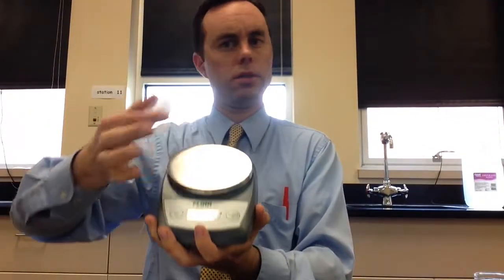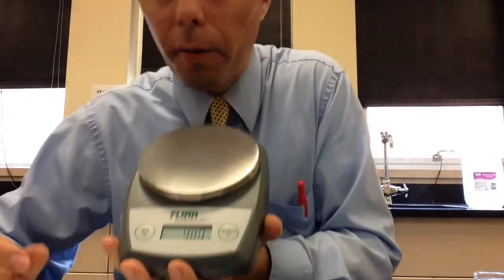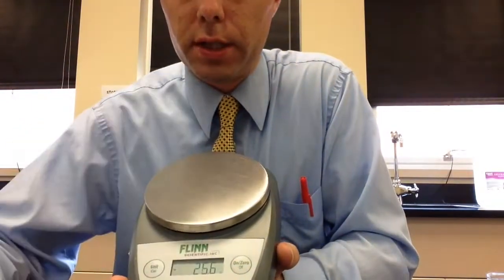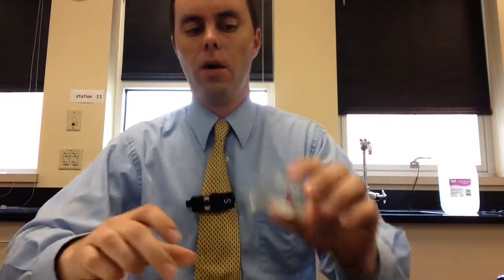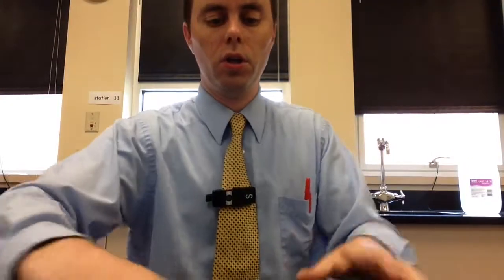To do that, what you'll do is, on the scale, you'll place this little weigh boat. It's not going to sit on here because it's diagonal for me. But you'll place this on here, and then you'll see that there are buttons on here. One says on/0 off. Once you put this container on there, you're going to click that button, the on/0 button, and that will zero out the scale. So it won't be measuring the weight of this. It will only be measuring the weight of the salt that you'll pour in there. So at that point in time, you are going to take the salt container, the beaker that you've got of salt, and pour 3 grams of it into this weigh boat. Once that is completed, we're going to move on to the next step.